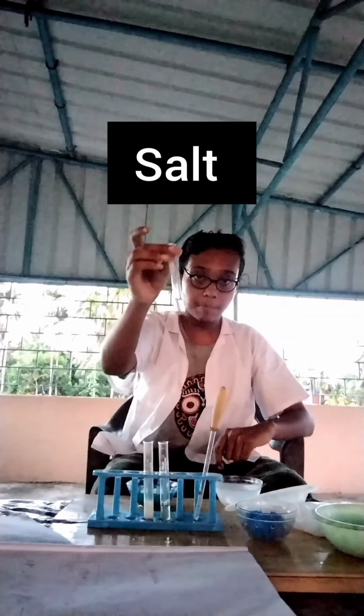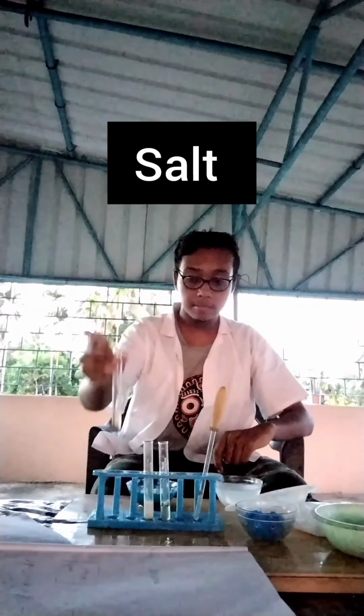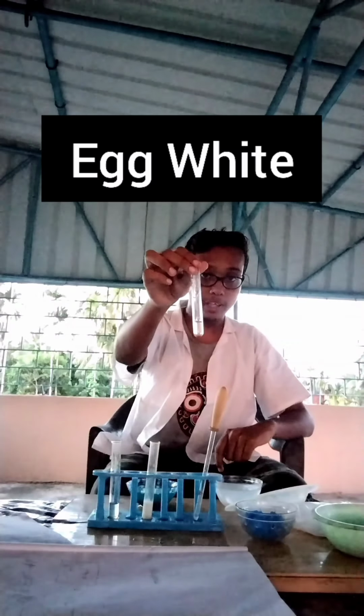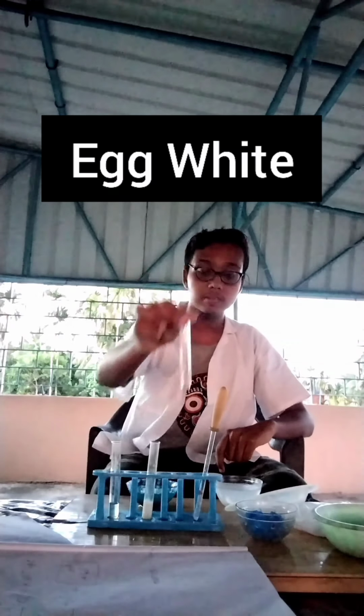For today's experiment, we will be testing three of the most commonly used food samples at home. They are a salt sample in solution, milk solution, and egg white, pure egg white. The yolk part of the egg is separated.